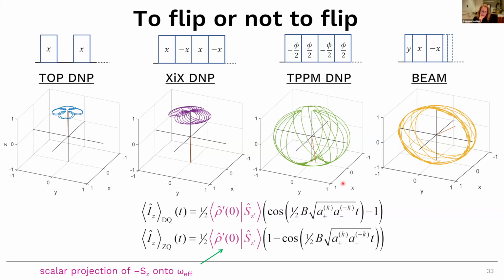So it's an interplay between the T1E and the sequence that you're using. How that's going to play out, I think needs to be investigated. I have no definitive answer of what the consequences will be and what one can do at higher or lower temperatures. It's not really been done, so I don't know.